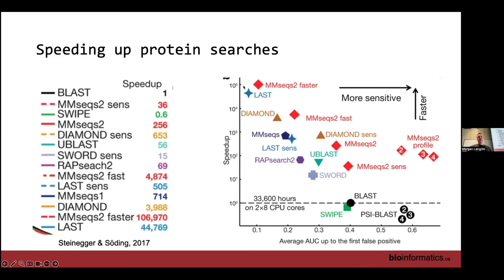Okay, so moving on to local-based systems. This is what we're here for, to learn how to do it yourself, essentially. Even within here, there are a lot of different approaches, because there are different similarity search tools, different databases, and different normalization. It's a fun bioinformatics thing to do, to think, I can make my own and make it better. And we did it too. It's just that no one can agree on anything, of course.